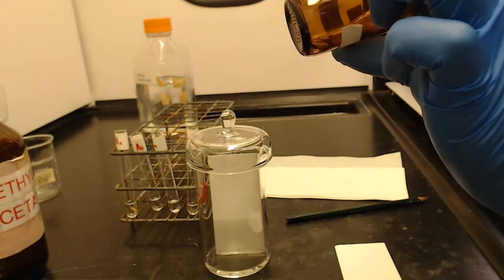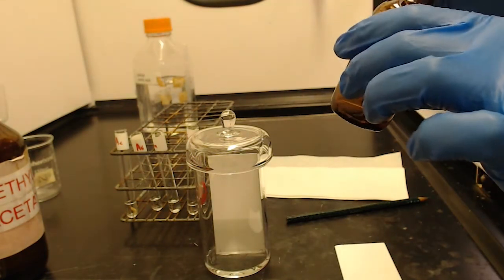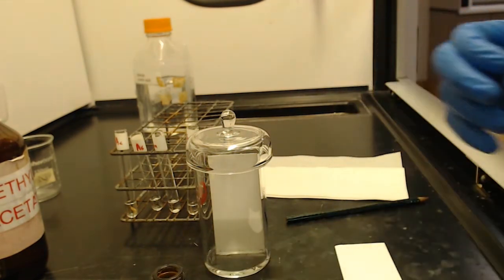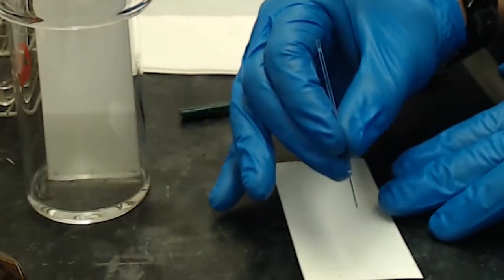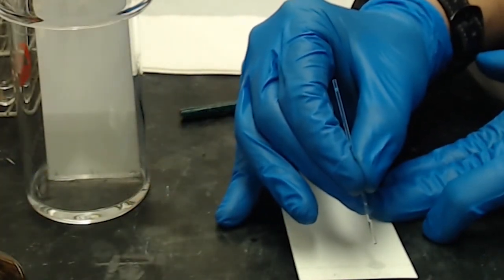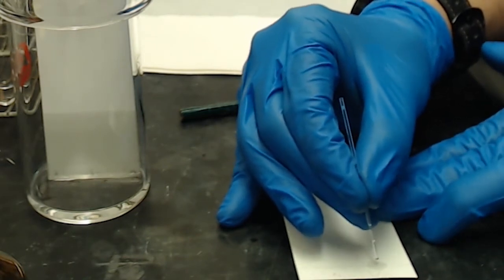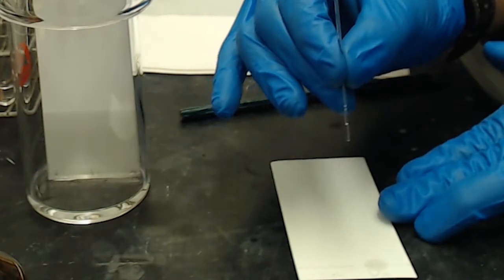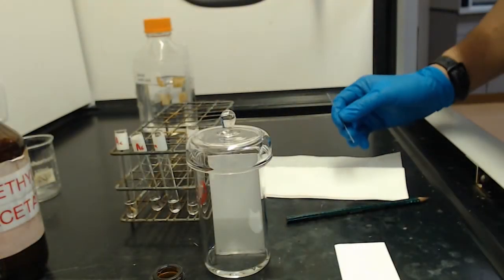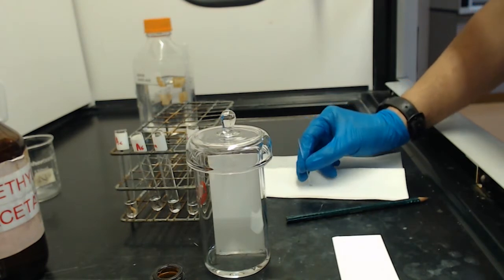So we'll see. I'm going to touch it into the liquid here. It's really low level there, but it's okay. Just got to touch the liquid. Yep, I got some. Touch it on the line. Yeah, I think that's good. That's a huge spot there. It's a little too big, I think. Okay.